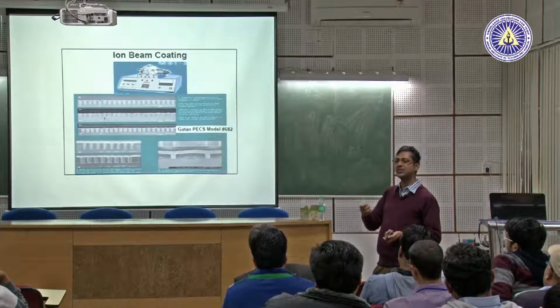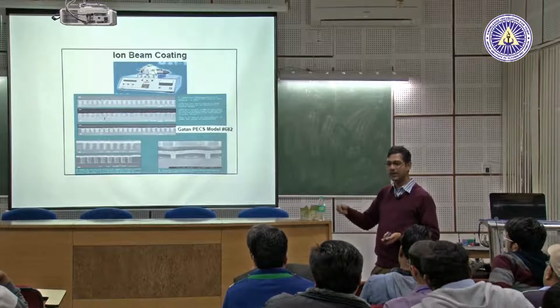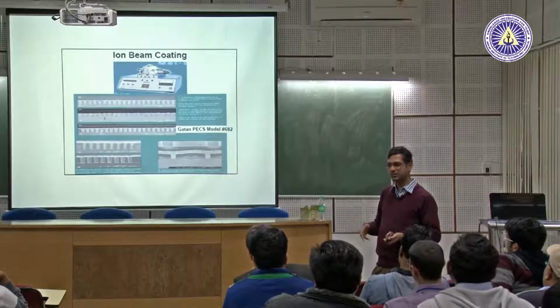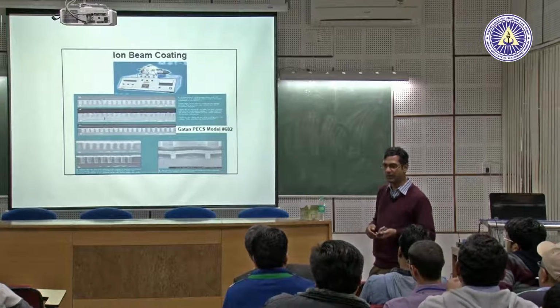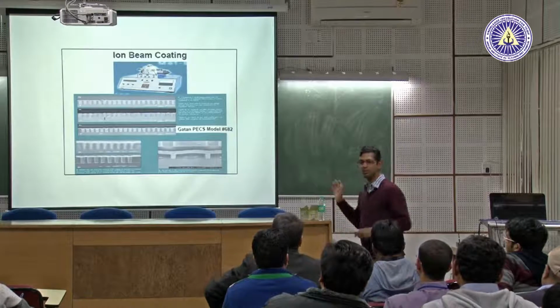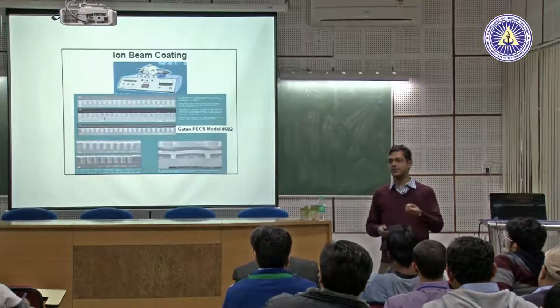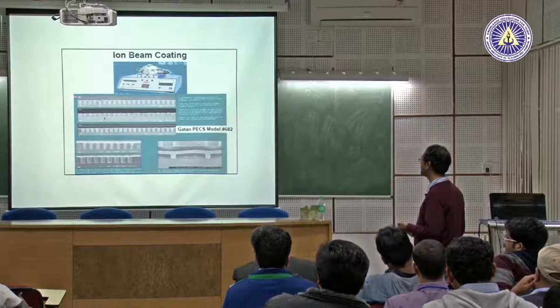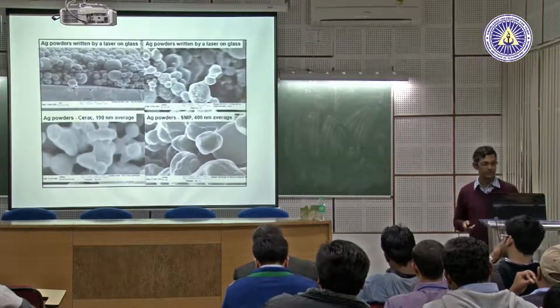People even use, I have seen, you can buy graphite powder and dissolve it in some solution like alcohol and paint it. Polymer people now, even it is done. But this is a better technique where you can control. Even nowadays you can coat with carbon. Carbon can be used as a coating material instead of gold, because carbon is very cheap.